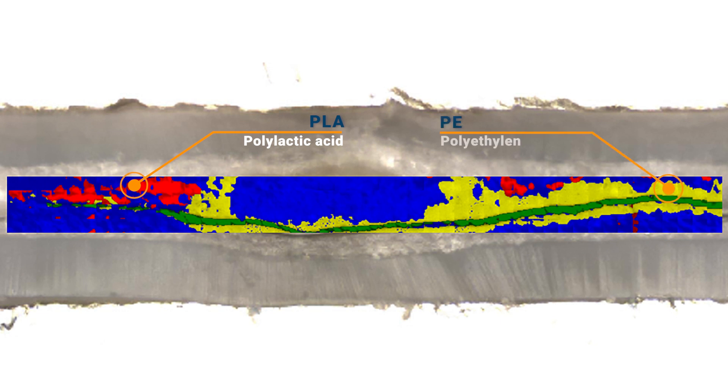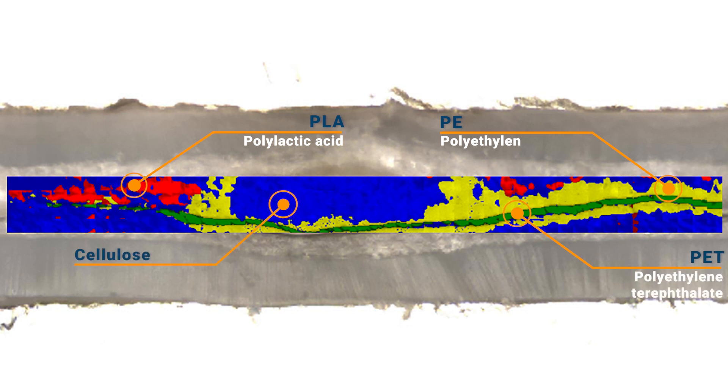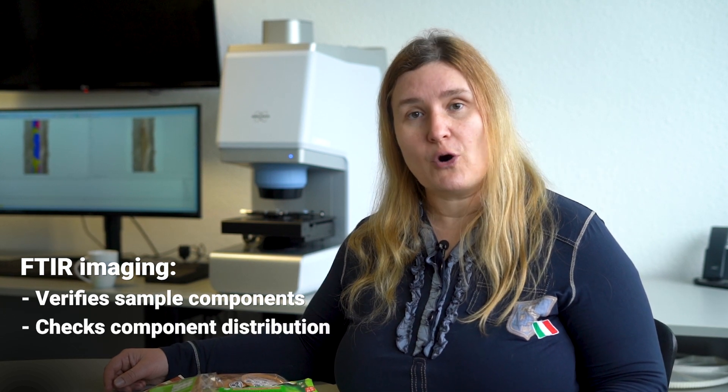Polylactic acid is shown in red, polyethylene in yellow, and polyethylene terephthalate in green. The blue areas are cellulose. FTIR imaging not only shows that all relevant components are present, but also that the component distribution is optimal.